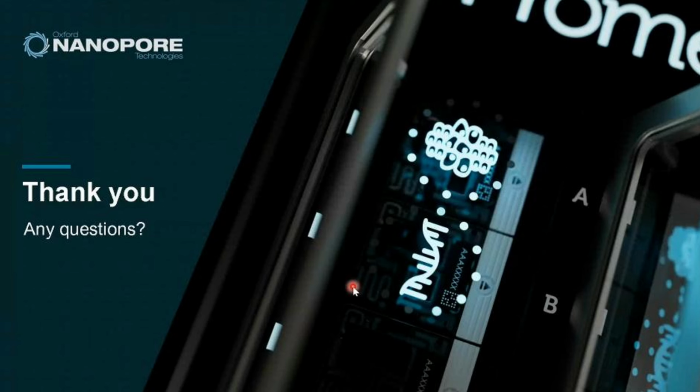In the chat box, we have a question. What kit would you suggest for WGS of a specific bacteria species, for example Klebsiella, in environmental water samples without the bacteria enrichment or culture method? Do I need to perform any PCR or use a barcoding kit too?